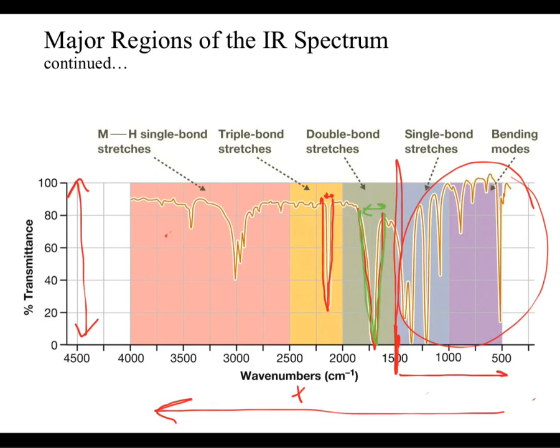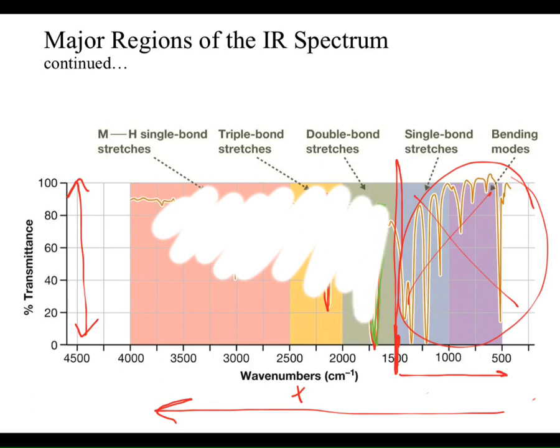No, you can ask. Oh, you're not? Okay, ignore it. Don't even worry about it. Okay? With a little bit of a caveat. There is useful information in there, and if you get nothing from out here, then you should look into that range. Okay? So you can't always just ignore it. That range is known as your fingerprint range.